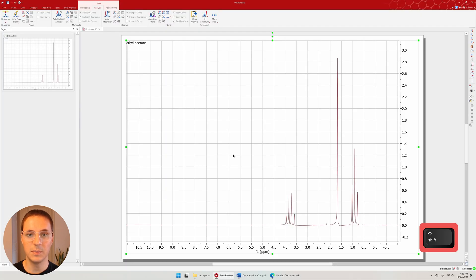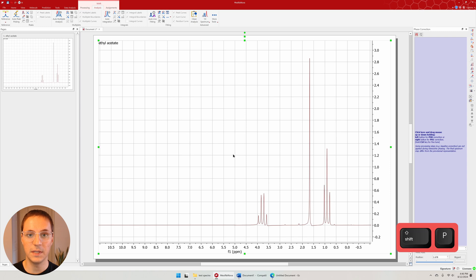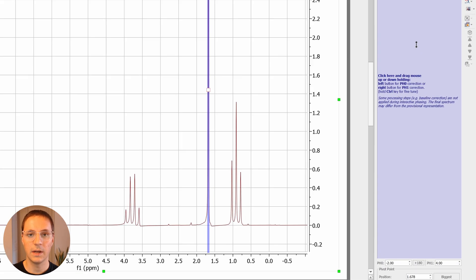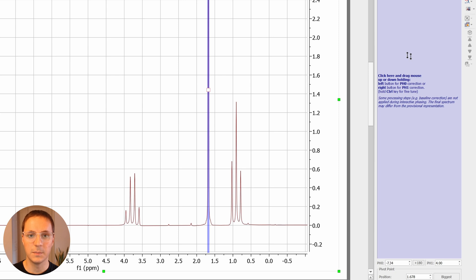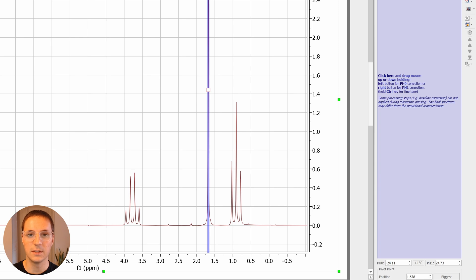Press Shift P to enter the phase correction tool. Click and drag the mouse up and down to adjust the phasing. Phase first with the left mouse button and then with the right. Make sure the baseline looks even on either side of a signal.